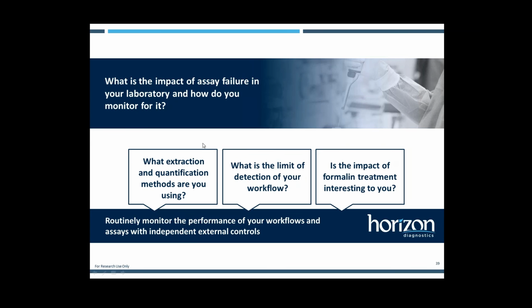And so it brings me around to the question I asked at the start of the webinar: what is the impact of assay failure in your laboratory, and how do you monitor for that? On the molecular assay side of things, there are three questions that we get commonly asked about, and these are questions that we are very passionate about supporting and very good at helping laboratories to answer. What extraction and quantification methods are you using? What is the true limit of detection of your workflow? And is the impact of formalin treatment interesting to you?